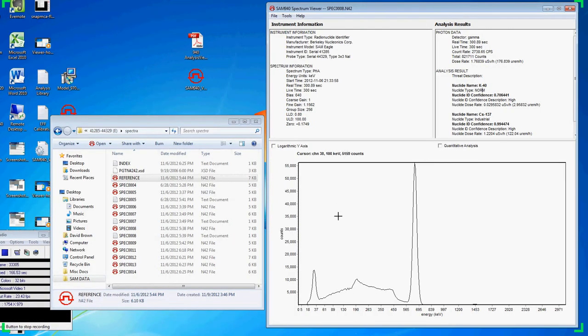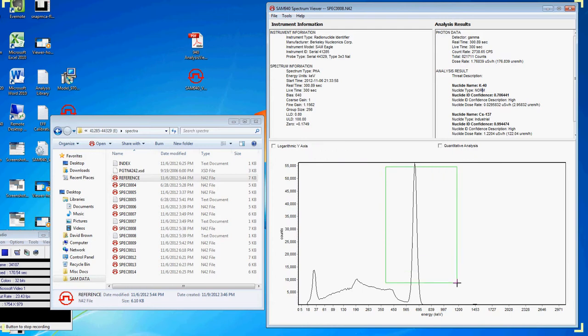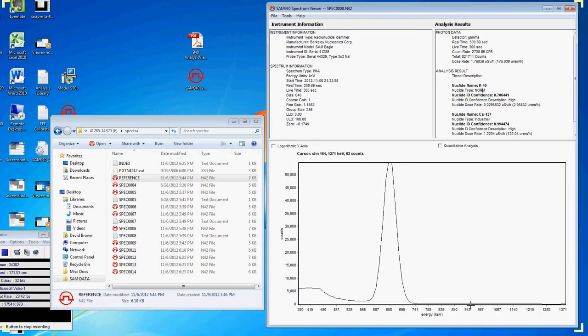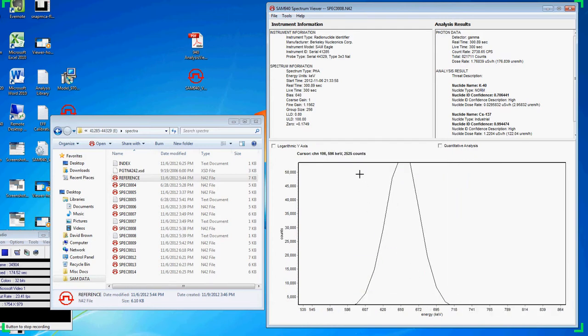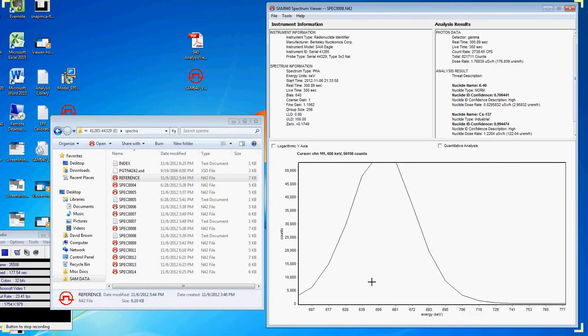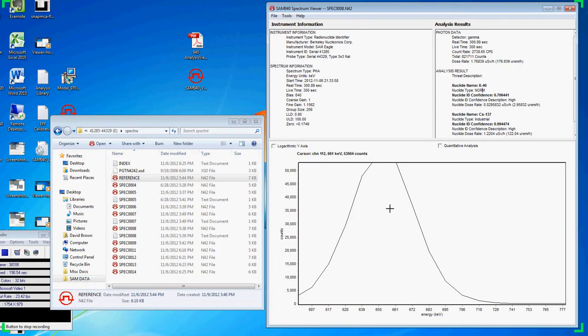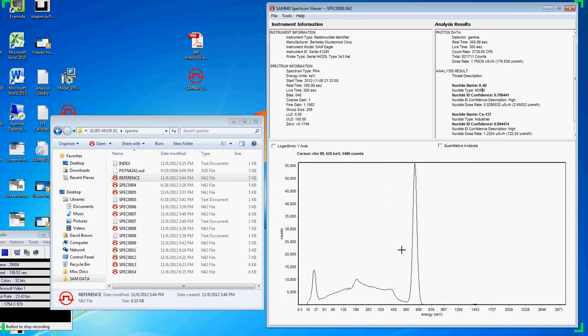Another handy tool is to zoom in on your peaks. Do this by dragging the mouse across the peaks. As you move your cursor around, you will see the channel and count rate at that particular location. In this case, we see the 661 keV peak we would expect to see from our cesium-137 identification. Simply scroll in the opposite direction to zoom back out to the entire spectra.